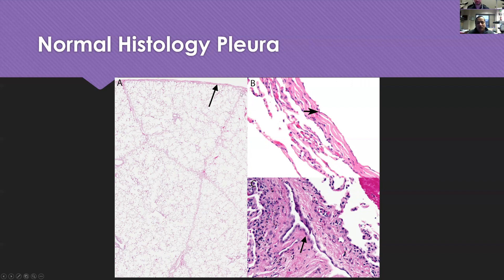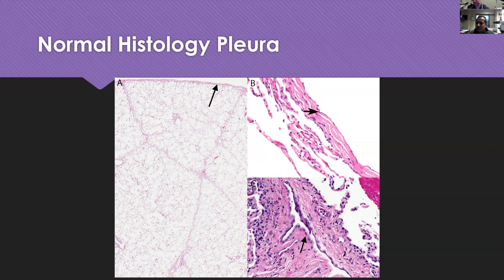The thing I would point out is that when you think of it theoretically as a medical student or first-year resident, you think: pleura lined by mesothelial cells, so I must see cells. But look at it — you don't really see the cells. Most of the time you just see this thin layer of pink collagen, and you don't see any cells. Maybe the cells are too flat, or maybe they've just sloughed away by the time it gets to histology. If we threw a WT1 stain on here, it would pick up some things. They just get really flattened and elongated in normal conditions when they're not reactive.